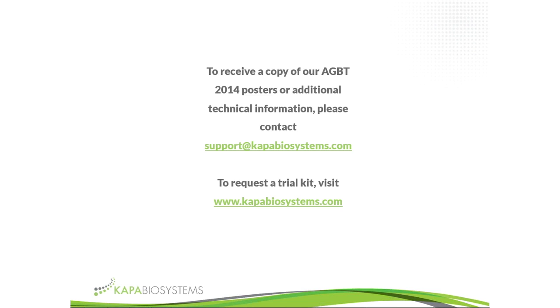That's the full TruSeq adapter. It's not a very stable molecular structure. So if you have adapters that are not fully duplexed during adapter ligation, only those that have a fully duplexed Y at the time of adapter ligation will be able to participate in library construction, or in that ligation reaction.